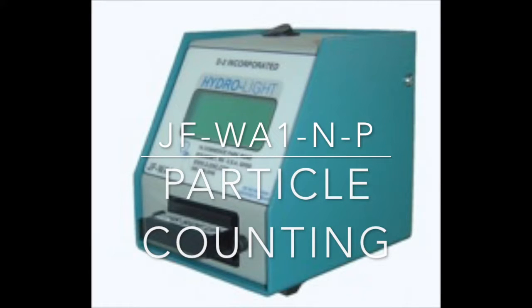Welcome to the D2 Incorporated JFW-1NP for particle counting video. In this video we're going to show you how we've upgraded the highly popular HydroLite on the screen here for particle counting.